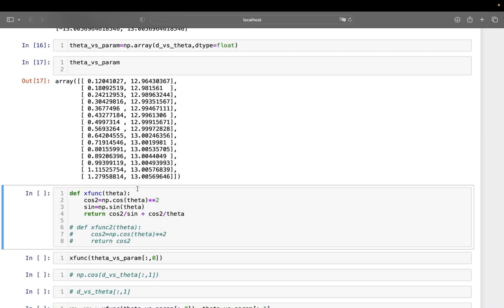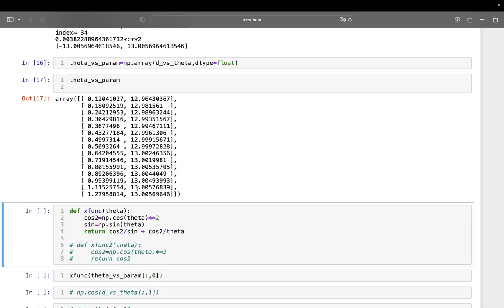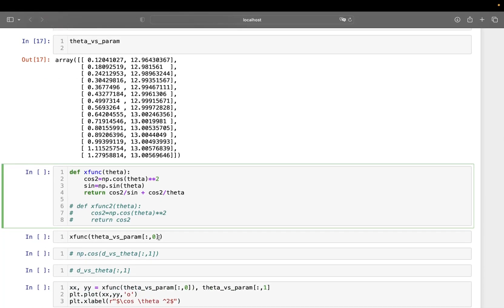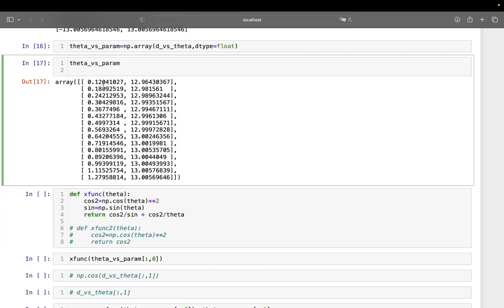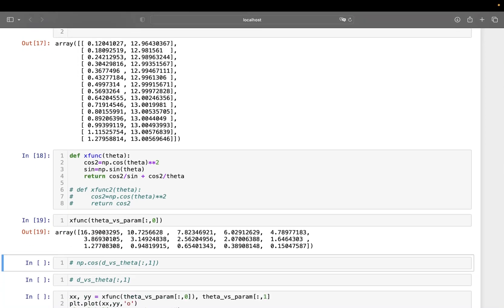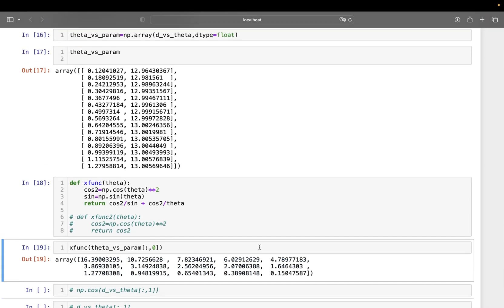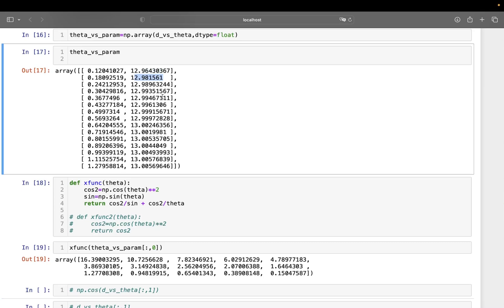Now we want to do some kind of straight-line fitting so we can identify the exact lattice parameter. You can see c values range from 12.96 to 13.005 — regression is generally better than simply averaging. The Nelson-Riley type function maps θ values along the x-axis and the lattice parameter c along the y-axis.